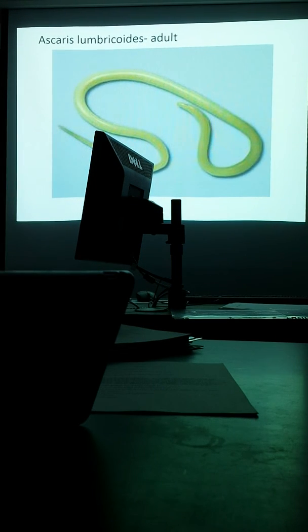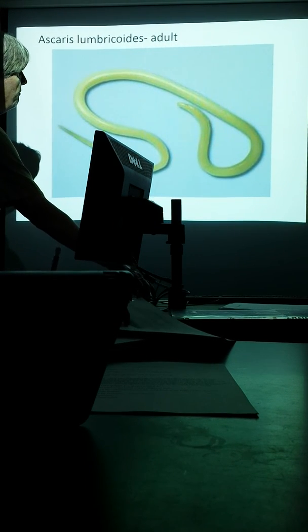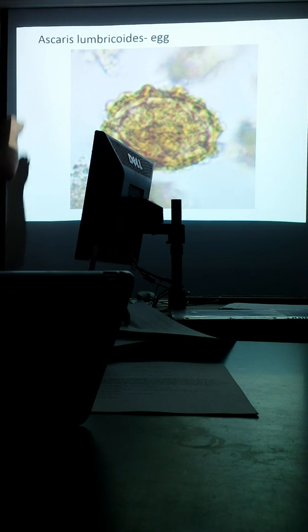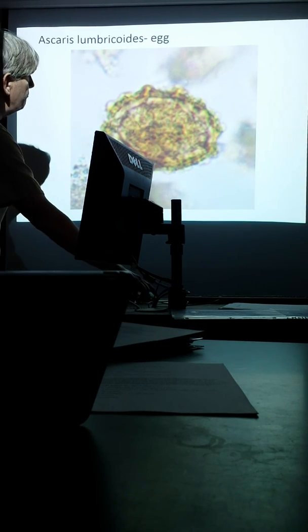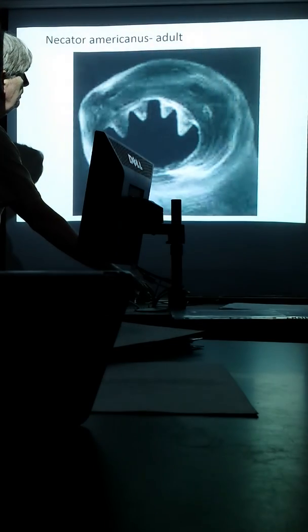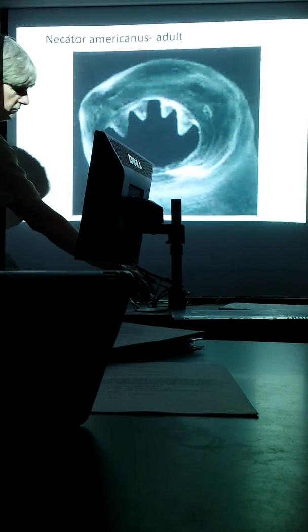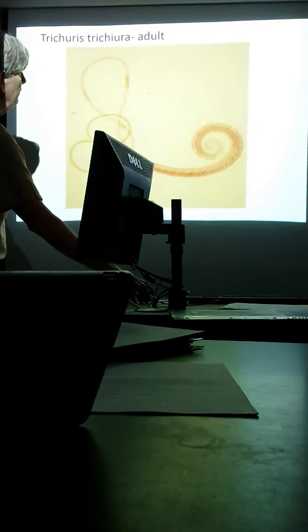Here's Ascaris. Of course, over there I've got the 2 samples. So remember, the big one is the female, and the smaller one with kind of a bent end is the male. And then here is the egg for the Ascaris. You've got that kind of bumpy sort of appearance on the periphery right there. And then the hookworm. Again, that pink picture is actually better for this than this one, but you can see the mouth plate, so that's where it attaches.